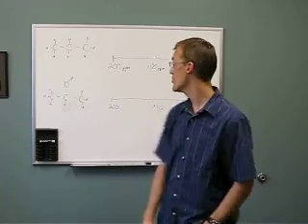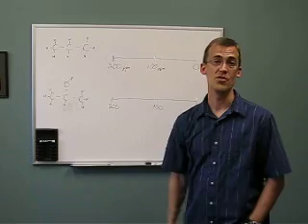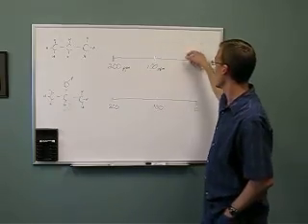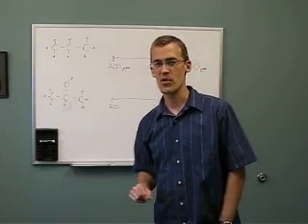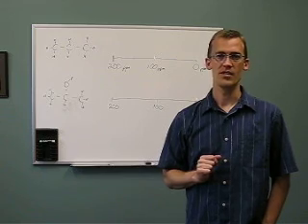The spectrum is produced, and we'll maybe try drawing a few of these, and that's a lot of what we're trying to do in lab. The x-axis is essentially frequency or energy, and we're going to see peaks at different places. Where they show up tells us a little bit about the identity of that atom. And for the most part, NMR can give us a unique identification for the molecules.